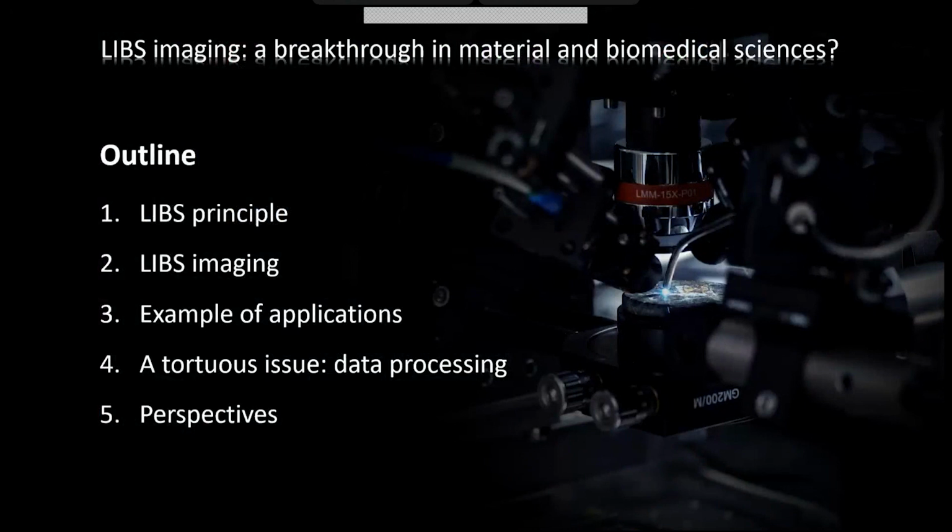And my research topic is really axed to imaging, so that will be a big part of the lectures. But I will start by presenting the principle and, let's say in a few slides, the general concept of LIBS measurements.